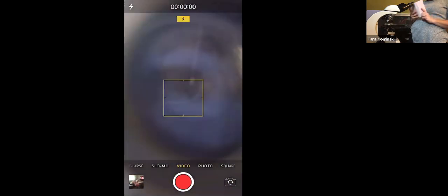I may not even have anything here. Let's see. I got some. All right, so I have it under scanning right now. I'm just gonna show you what it would look like. It's not gonna look like much. In fact, I probably gotta turn the light down a little bit. See that? Those little spots? Those are the cells. So let me now go under low power.